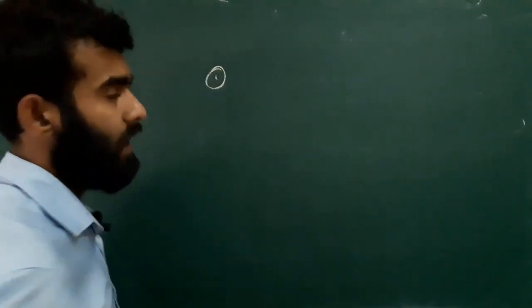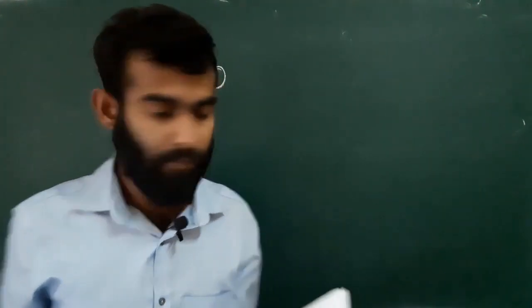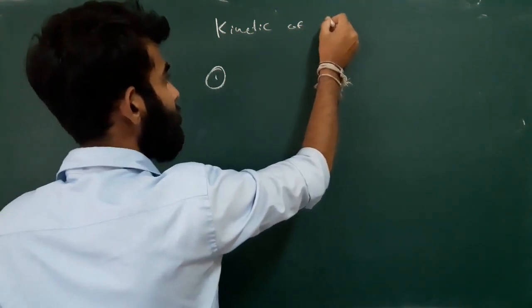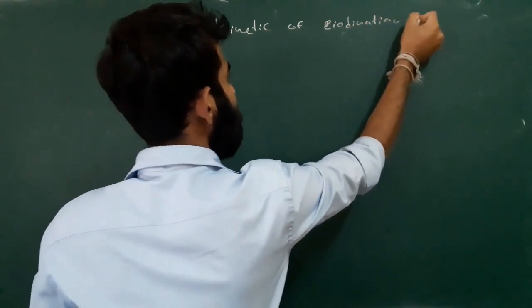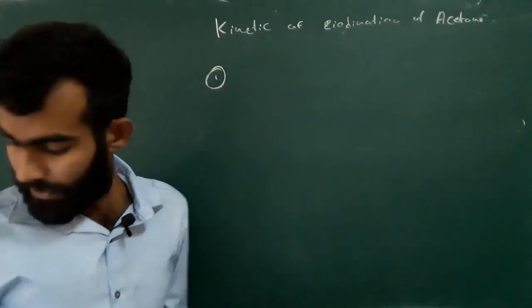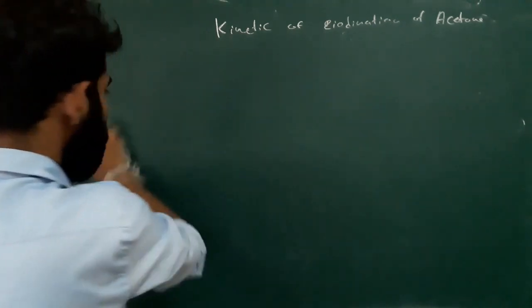Okay. Experiment number 1, kinetics of iodination of acetone. Iodination reaction of acetone. What was the basic reaction?